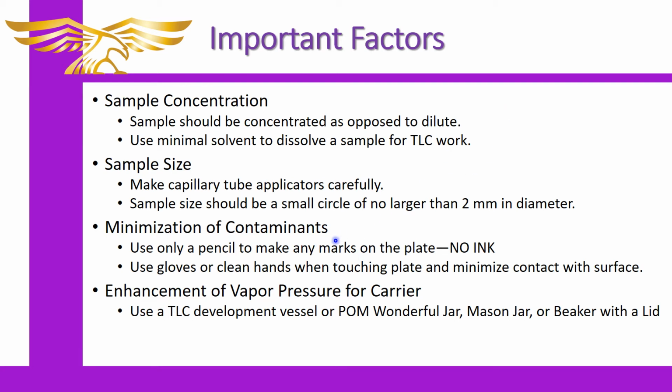The other thing that's important is minimizing contaminant. So one important fact is you should never use an ink pen to write on a TLC plate, because remember, most inks are organic compounds that are in a solvent, and therefore, if you put them on a TLC plate, you'll actually inject the plate with compounds, and they will possibly travel in the solvent and separate. So that is not something that you need or want to do with the plate. That would be bad. You want to use a pencil.